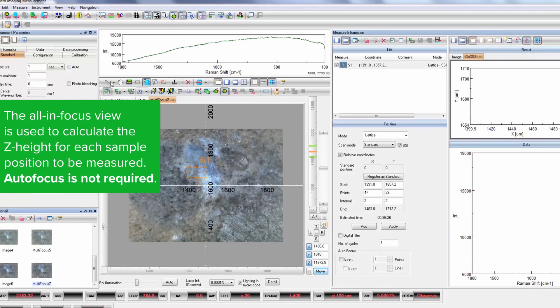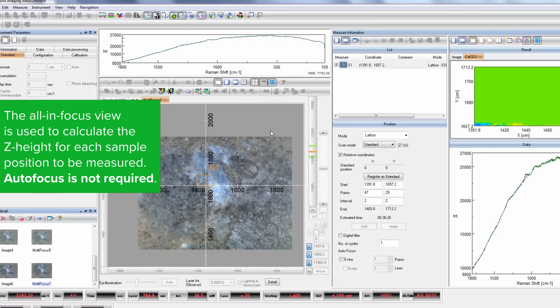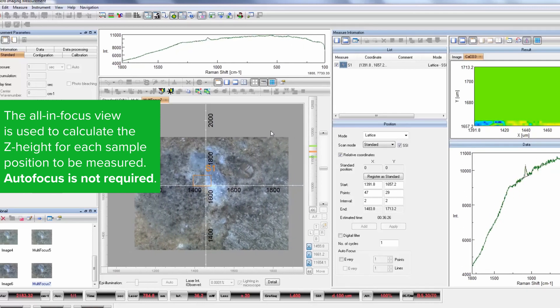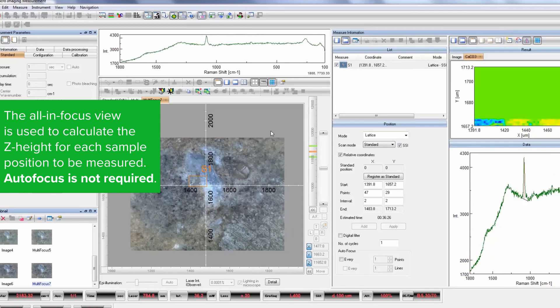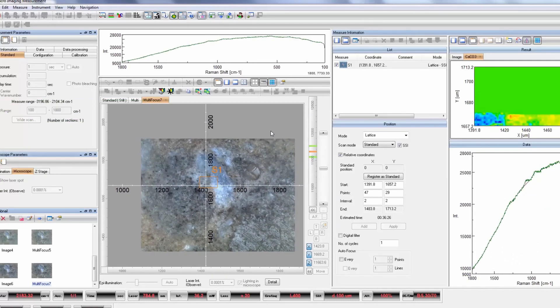In normal operation, as the stage moves from point to point, it's necessary to adjust the z height to create an automatic focal point to be measured.